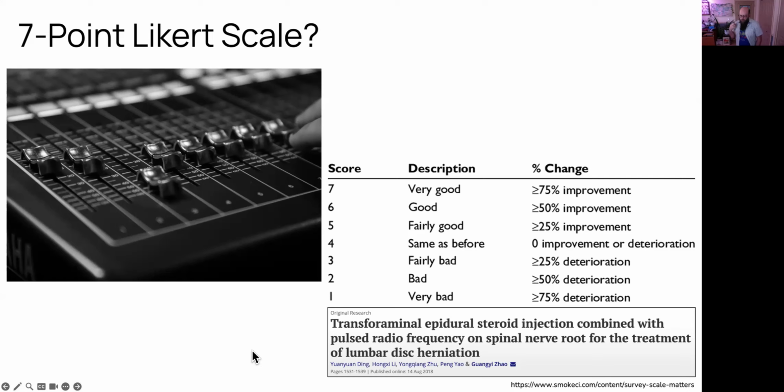And I put out there that we may want to have some kind of a scale that helps us say, if you're between, move this slider. Are you seeing two shapes of bacteria? Are you seeing 12 shapes of bacteria? What would that look like as a score?